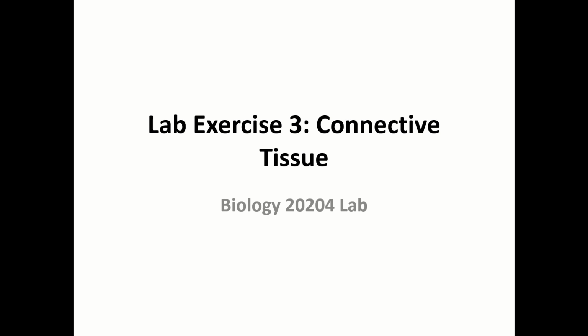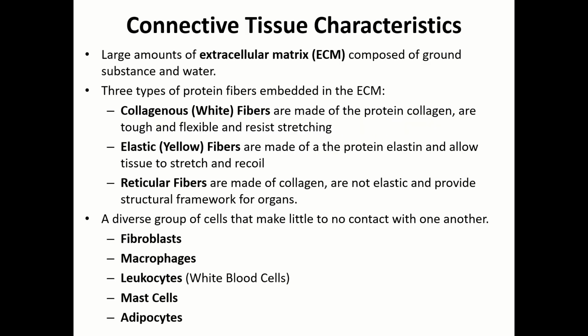This is the second video in a two-part series describing the tissues you'll observe in Lab Exercise 3. The first video observes epithelial tissue, and the second video looks at connective tissue. With connective tissue characteristics, you'll find that this is very different from epithelium.